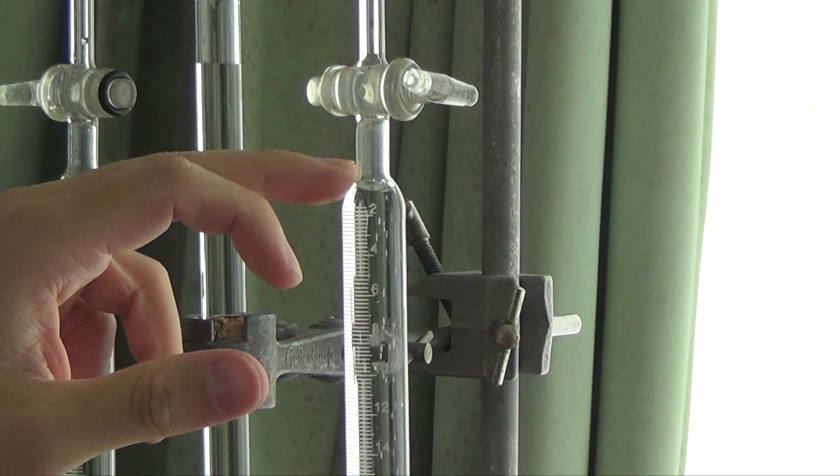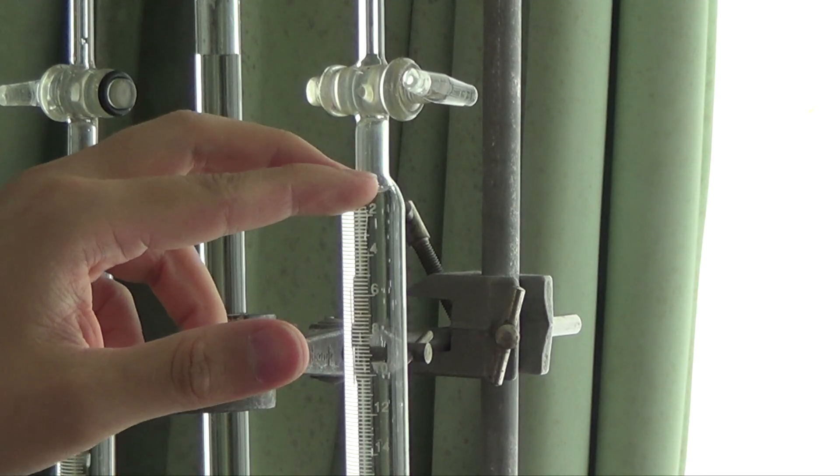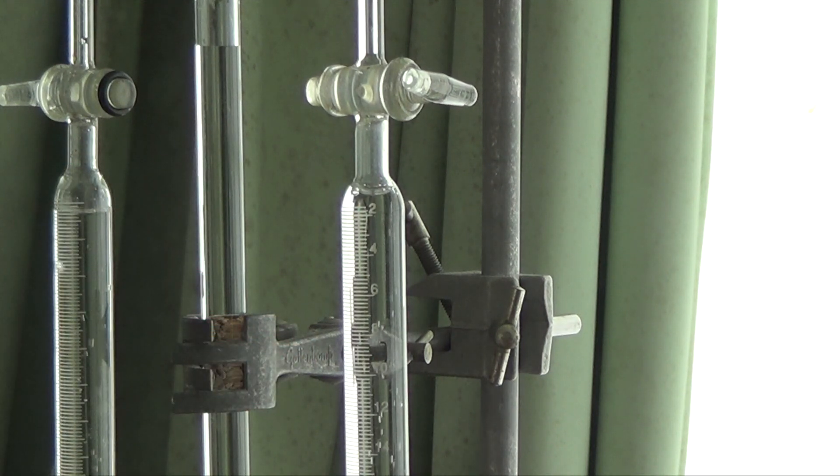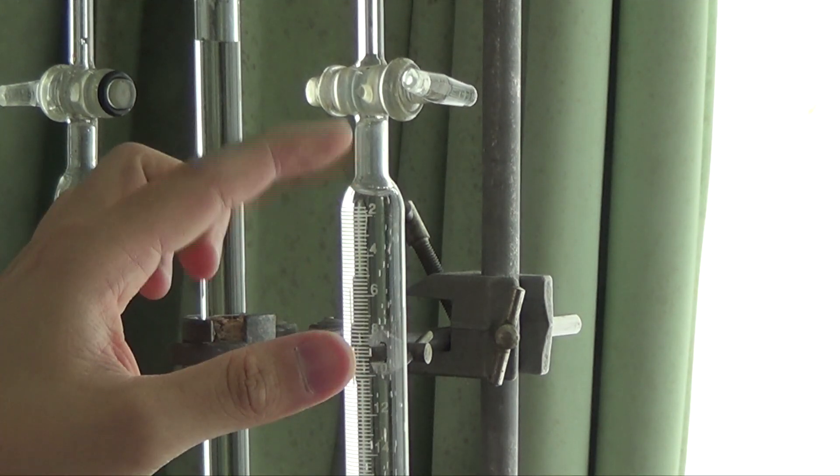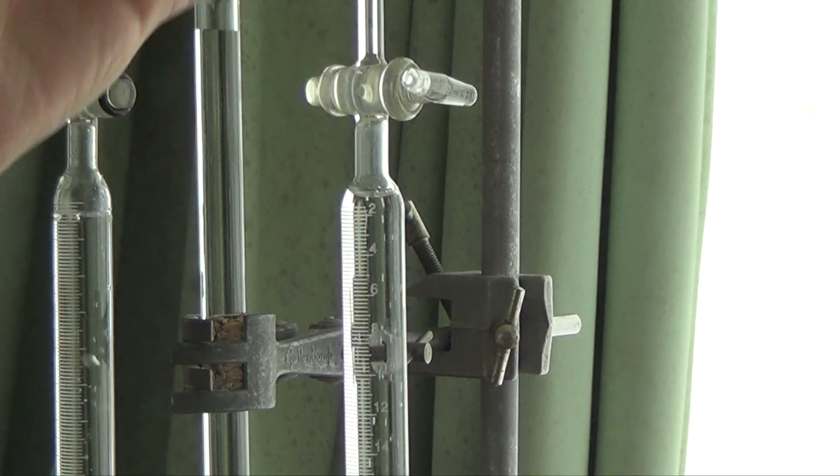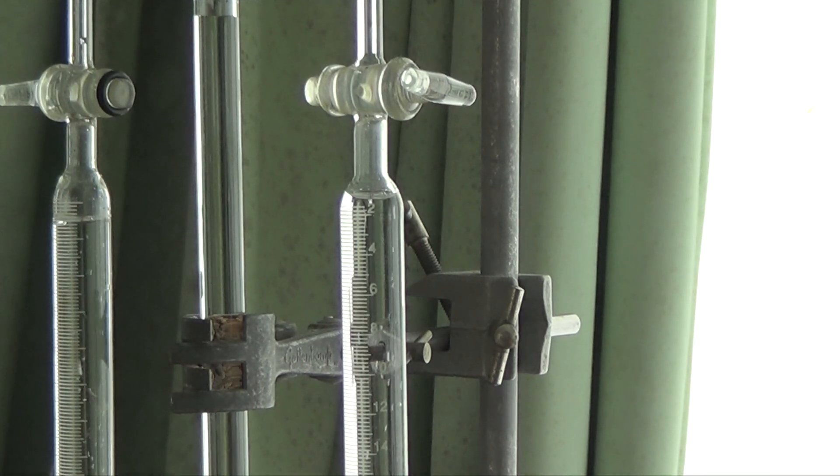And this is the hydroxide, hydroxide present in the water molecule. Of course, sulfuric acid is made up in water as well. So you're going to get OH- giving you oxygen gas here. We're collecting the gas here. We can release these outlets and test for the gas, test for hydrogen here and test for oxygen. These are all part of the 14 to 16 years old chemistry content.